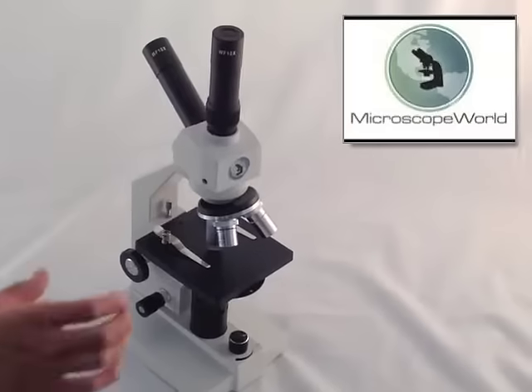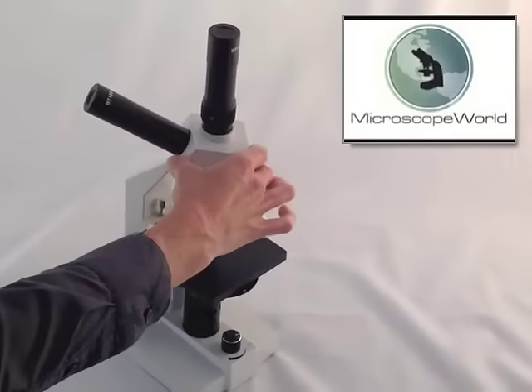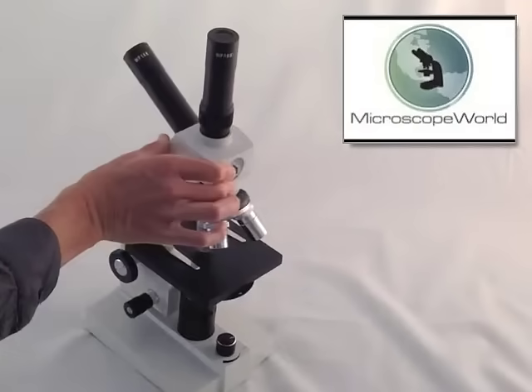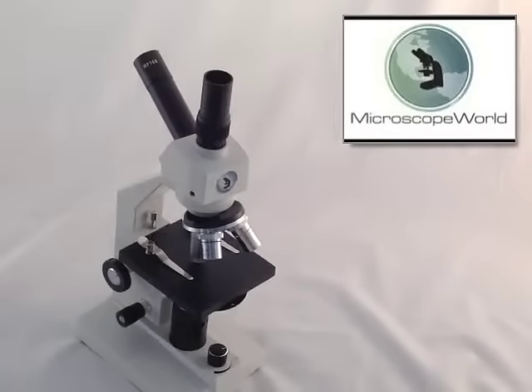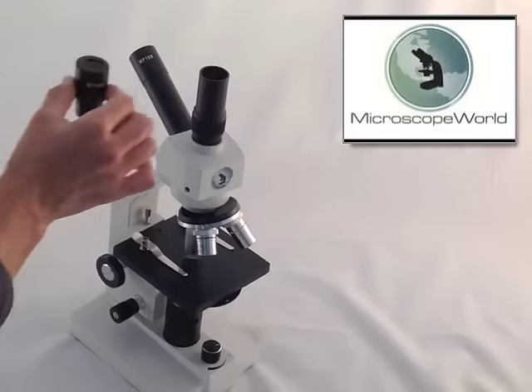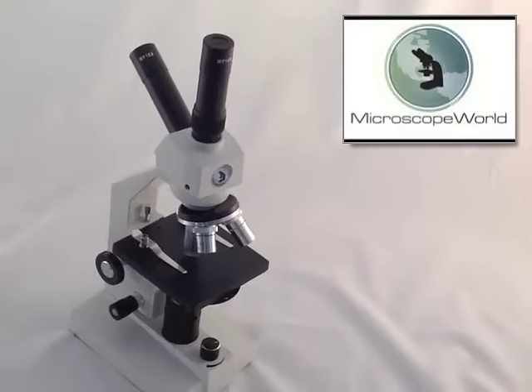There are a number of features on the HS1 that make it easy to use and very effective for scientific studies. The head rotates so that it can be used by more than one observer, and there's a second eyepiece in the vertical tube for two people to look at it at the same time. That can also be used for a digital camera.